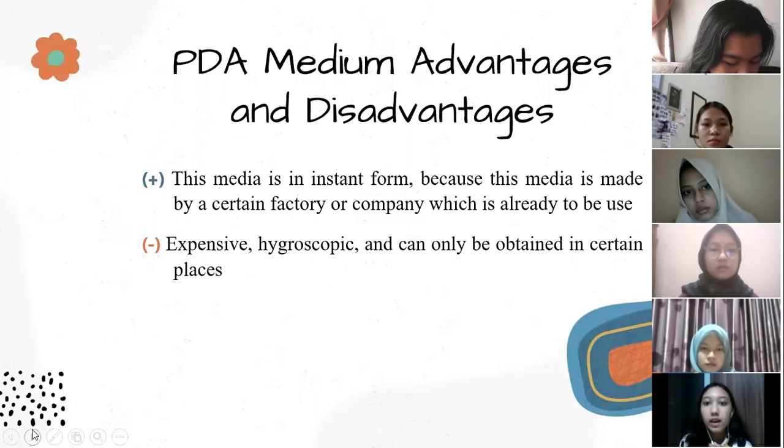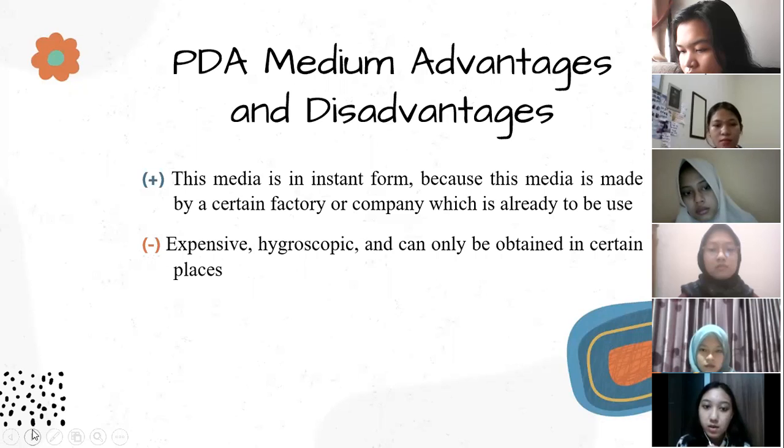PDA medium has advantages and disadvantages. The advantage is that this media is in instant form, because it is made by a certain factory or company and is already ready to be used. The disadvantages are that it is expensive, hygroscopic, and can only be obtained in certain places.